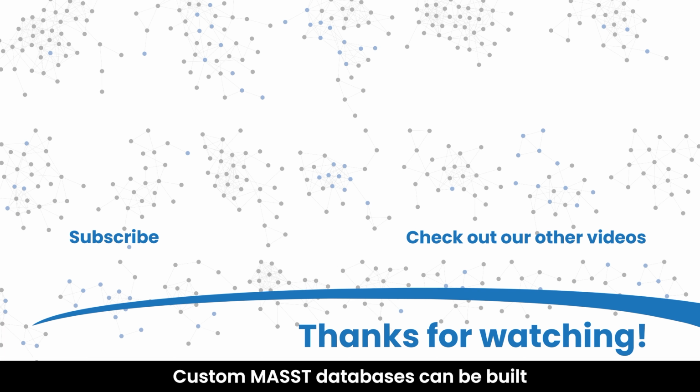Custom MASST databases can be built from public or private mass spectrometry data with as many samples and whatever metadata you can think of.